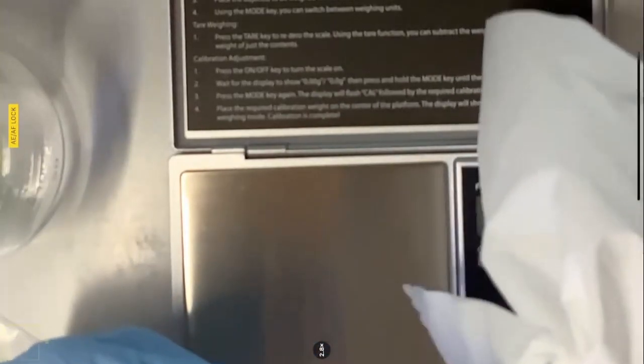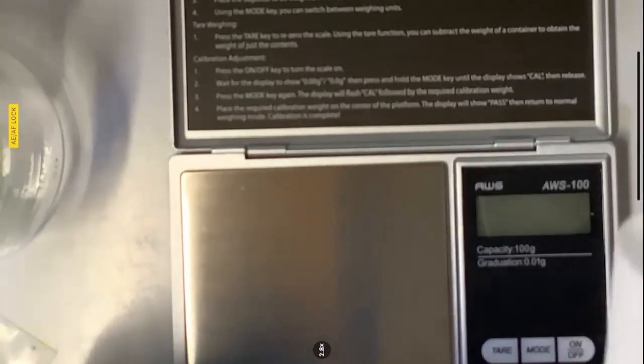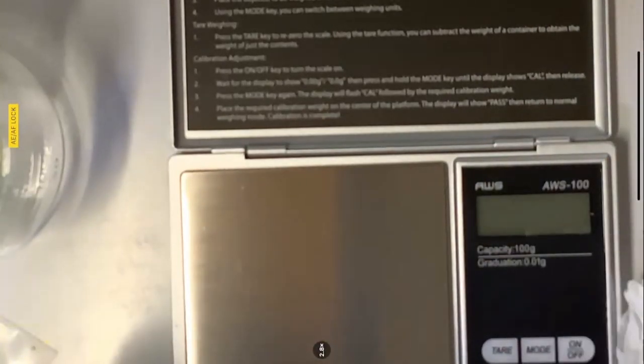Again, it's got to be clean. It's got to be dry. And the reason why you need it clean and dry is because if it's not clean or dry, especially, then it's going to affect your volume. It's going to affect your mass. And then your density will be messed up.